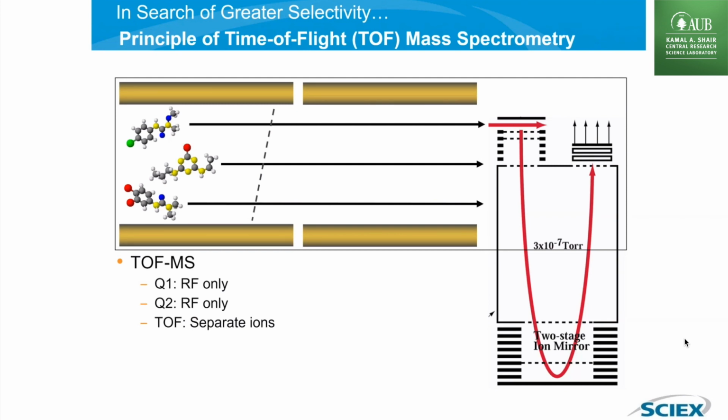Now, this happens relatively quickly. You may get 10,000 mass spectra in a second, right? So it's almost too fast that we can't think about it. So we never look at the mass spectrum first. We always look at something called the chromatogram.